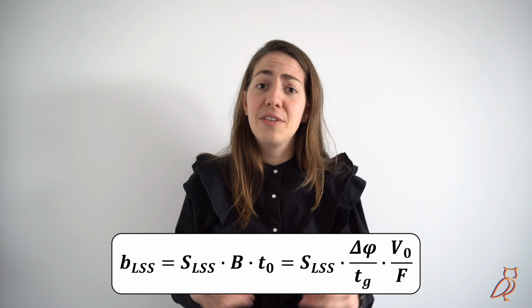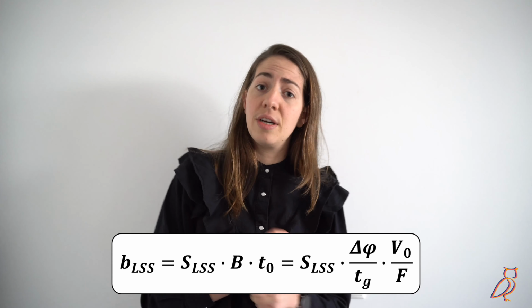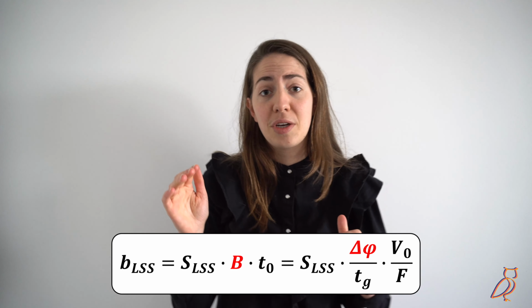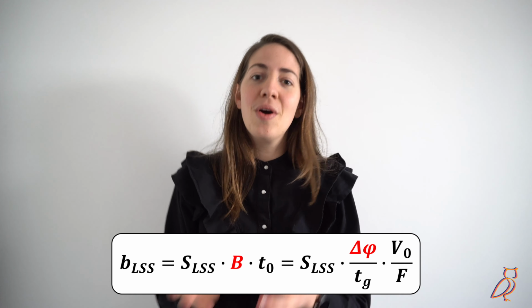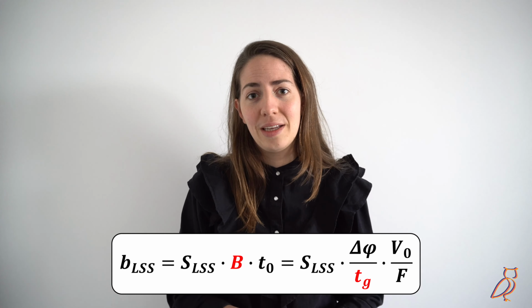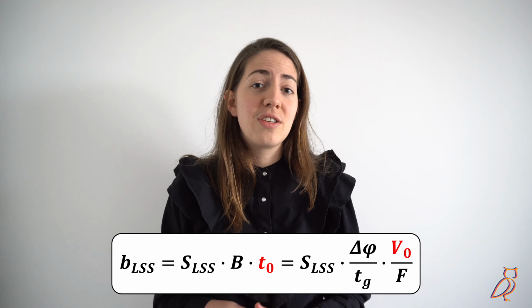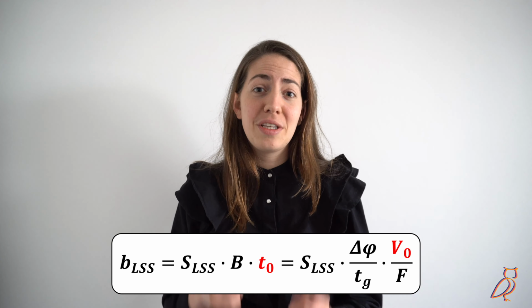Ways to vary this effective gradient steepness are to change the slope of the gradient by either changing the initial or the final concentration of the modifier within the same time, or to change the total duration of the gradient. You could also change the flow rate. You could also change the column volume, but you have to make sure that you have an identical stationary phase as the column that you used before.